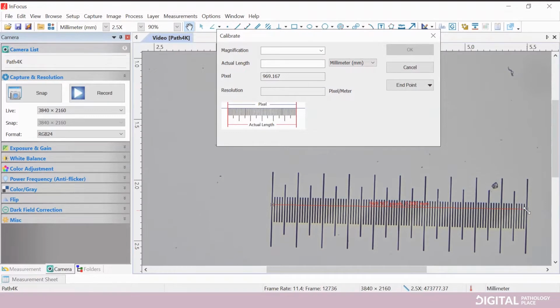And here again, you want to start and begin at the same side of the line. Of course, at higher mag, it's much easier to see, but I'll say that's very close. We're starting at the right side of that line. We're ending at the right side of this line. In this case, again, I think you said it was our 4x objective. Correct. Now, there are some objectives in here preset, but you can just type anything in by hand.